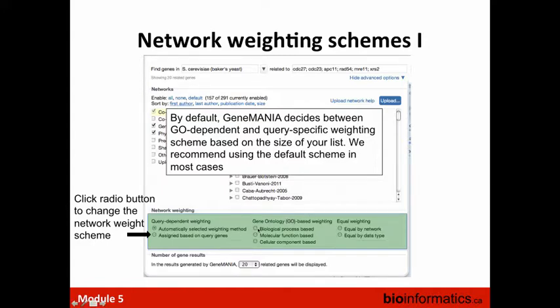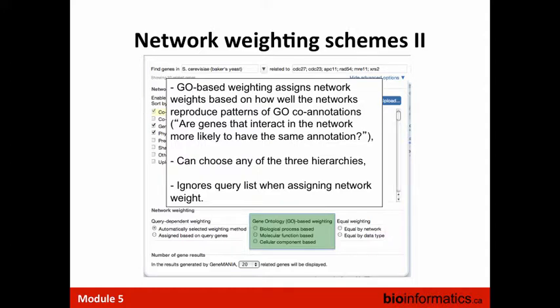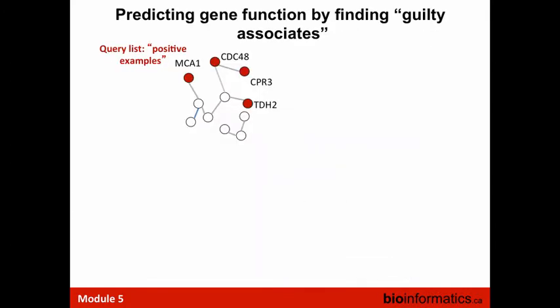If you want to define your question more precisely, you can specify whether you're asking about the biological process, molecular function, or cellular component of a single gene. You can choose from one of these three weighting schemes — we weight networks based on how well they reproduce co-annotation patterns in Gene Ontology, which has three different hierarchies: biological process, molecular function, and cellular component.